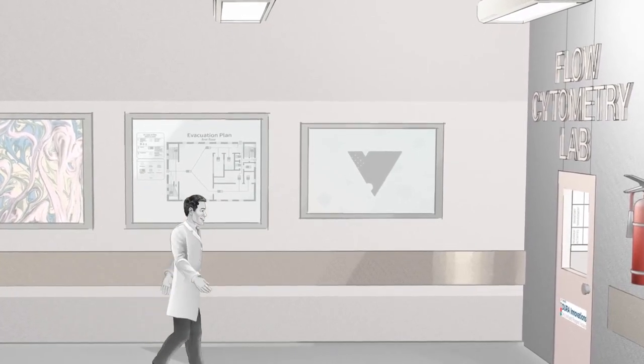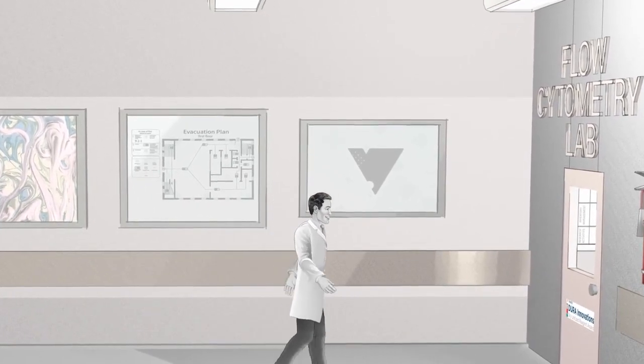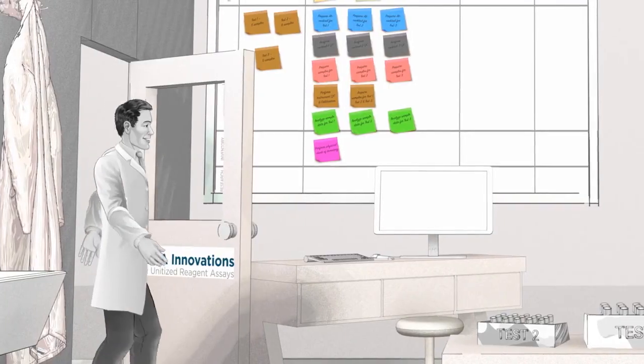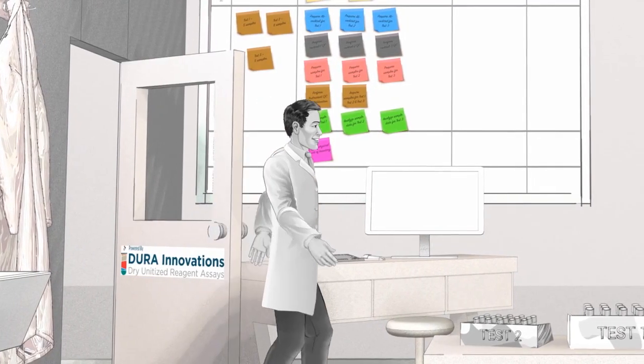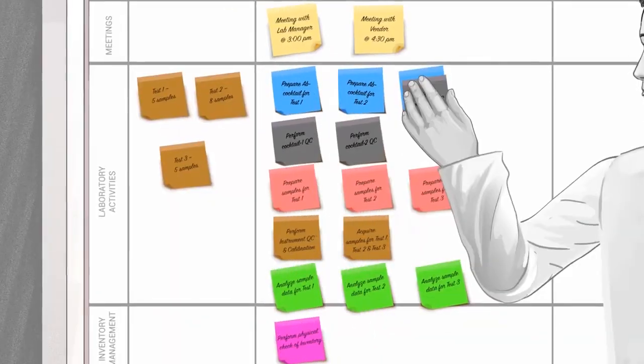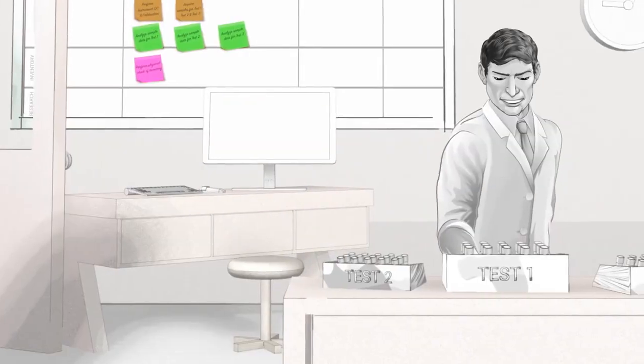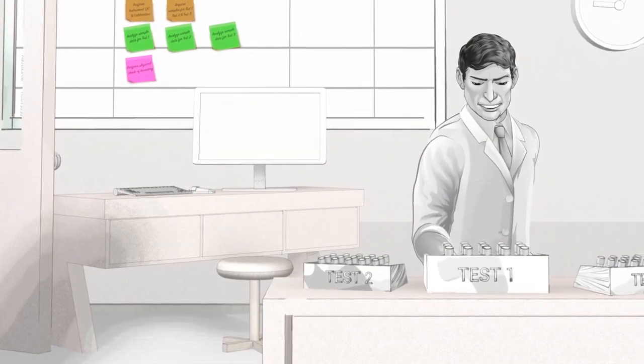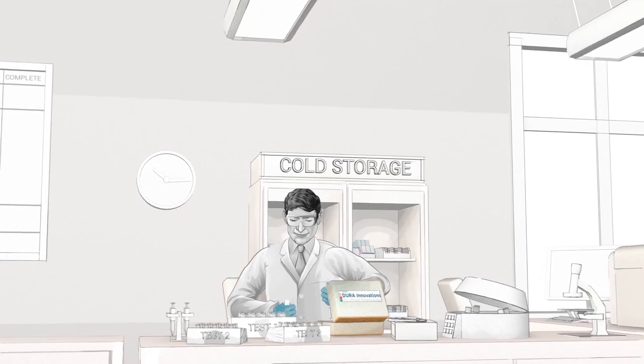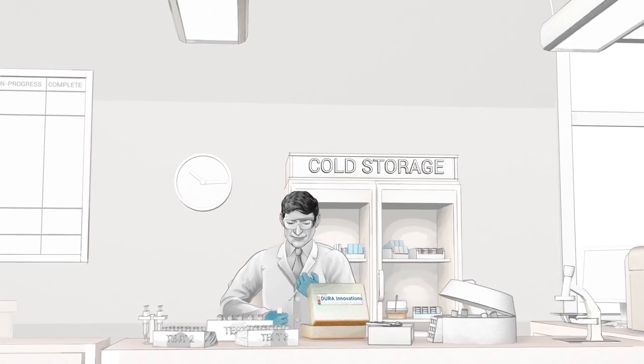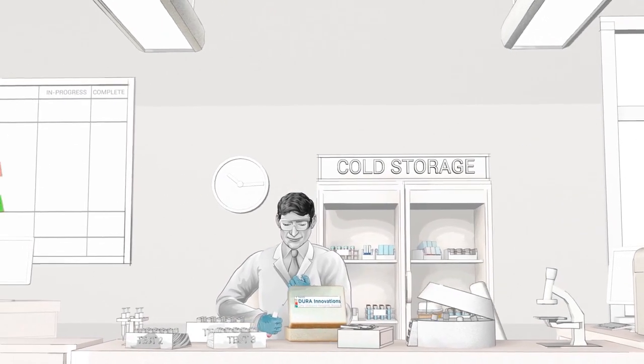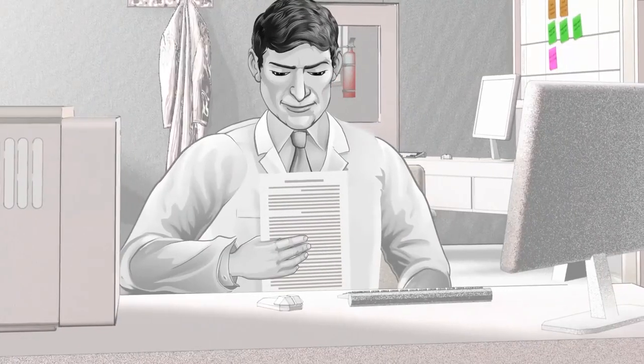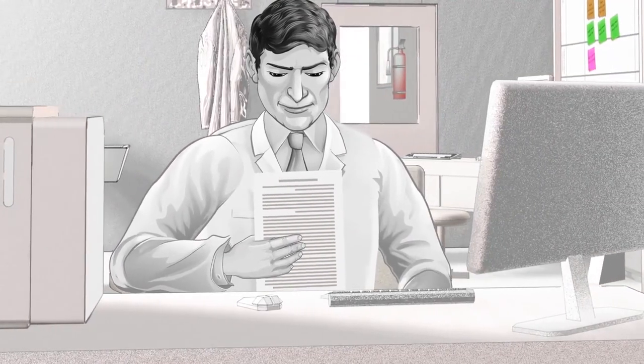Where no matter how many samples you have, there is nothing to worry about. Because with a unitized reagent tube that can be stored at room temperature, there is less time spent in inventory management and even less sprinting between the inventory and your table, and more time to work on the tasks that truly matter and that you love to do.